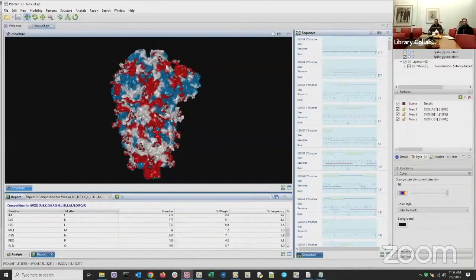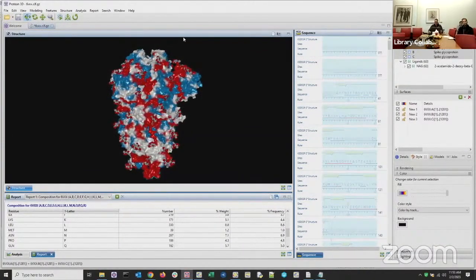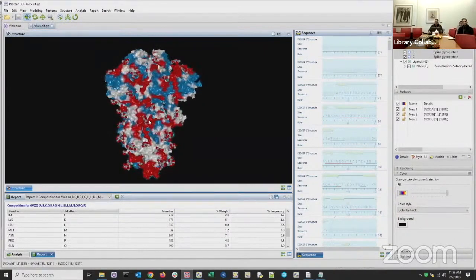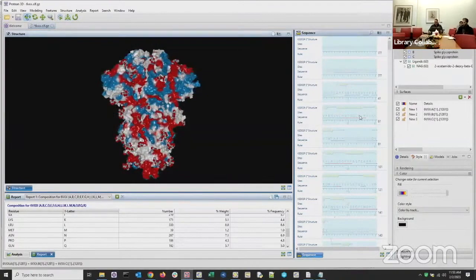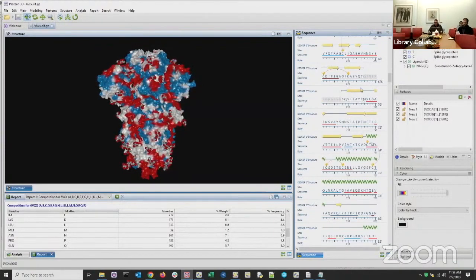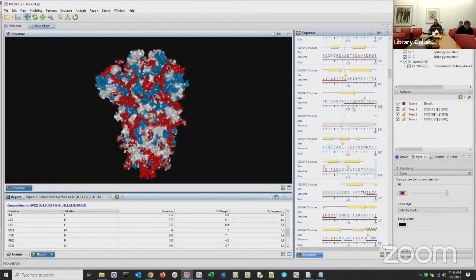So I'm going to quickly flip over here, and here's the spike protein with closed RBDs, which just means these RBDs at the top haven't been cleaved yet, and they're still in the closed structure, so that hasn't opened up yet for attachment. Now, what we can do is take those variants that we just found, and I can go to a specific 681 region. Let's see here, 681 is actually right there. It's actually missing, unfortunately, in this structure, but I'll go to the 614 variant instead.